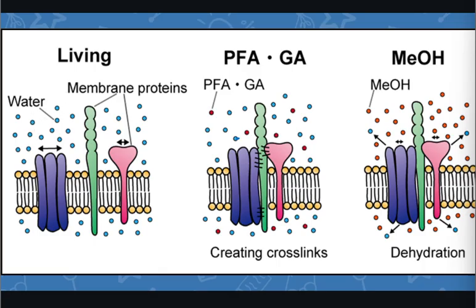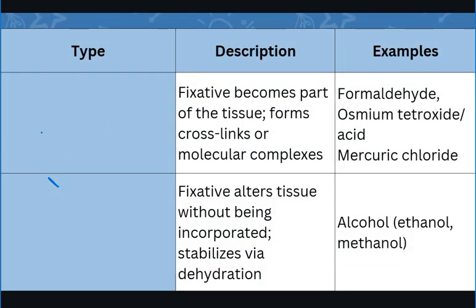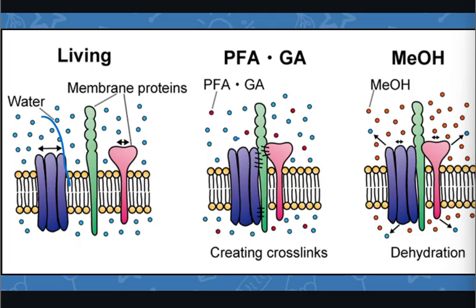The proteins can move laterally within the lipid bilayer and interact freely with other molecules. So our water here maintains the native hydrated state.